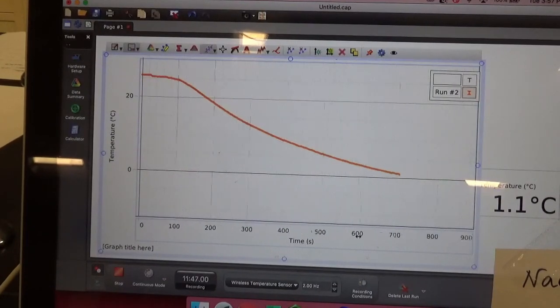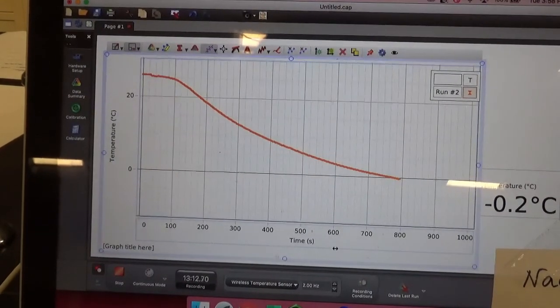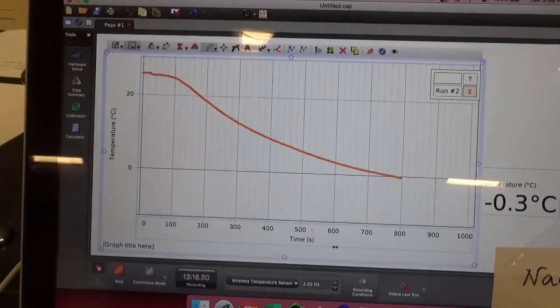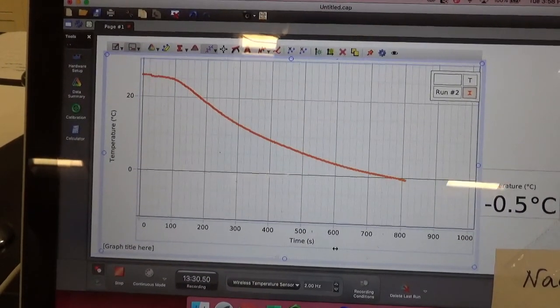Showing you this for a while so you could see how long and boring it was for us to actually do this experiment. So maybe you should be glad we're not doing it in the lab.